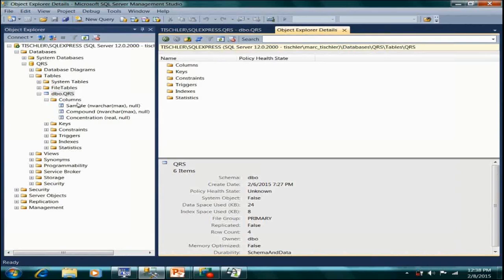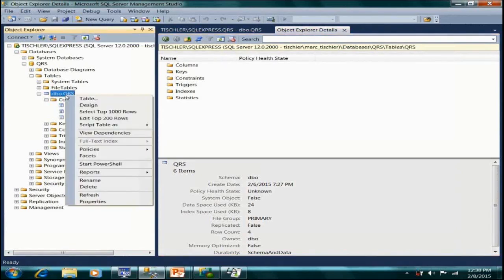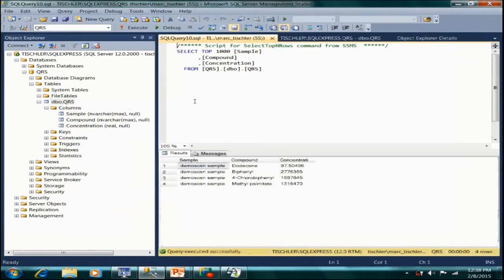This is a dummy example. You, of course, have your own LIMS, you have your own database, you have your own database schema, you have your own tables, etc. But it is possible with this recipe to integrate. Of course, the CSV has been supported for a long time, but this shows you how you could, what I'll call SQL Direct Connect.